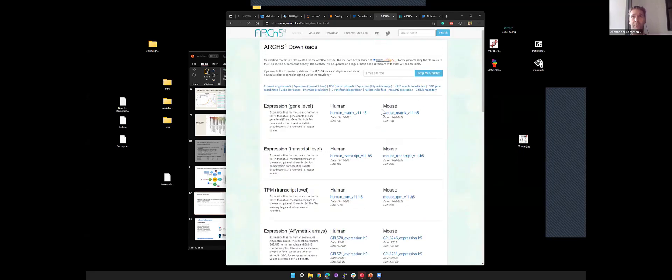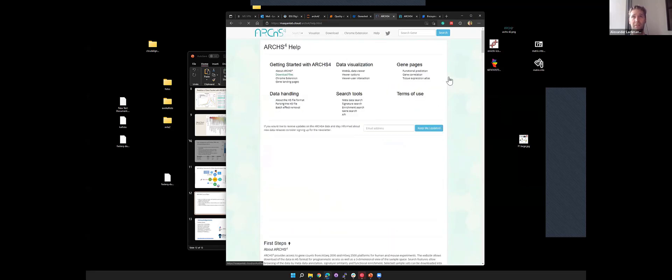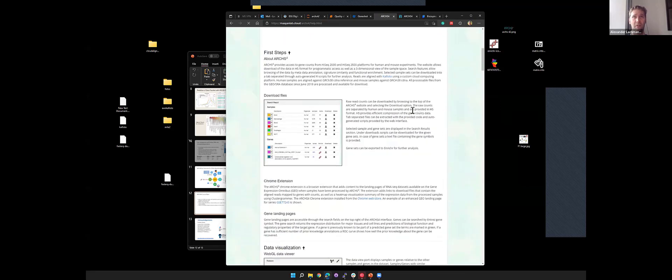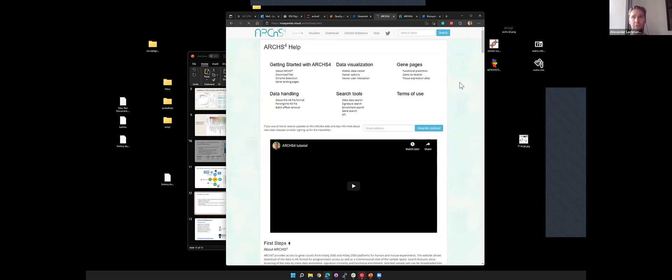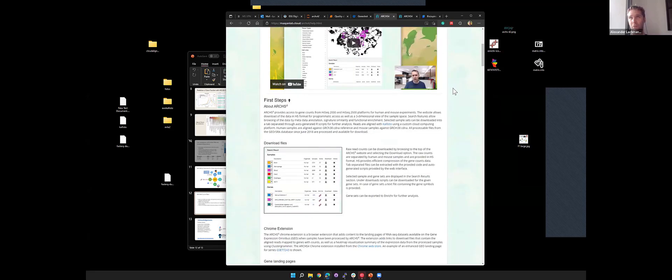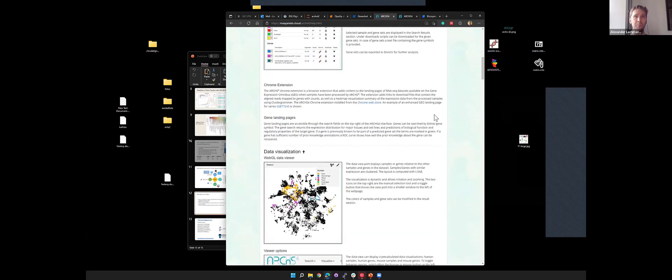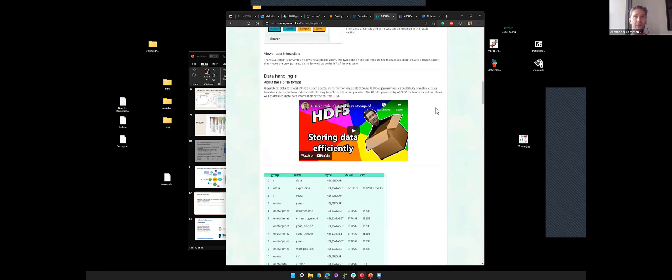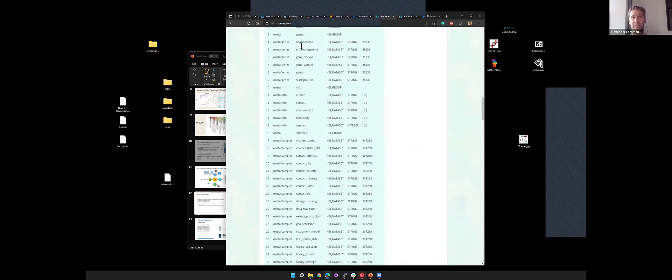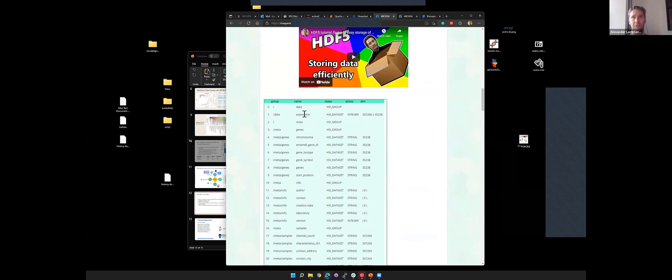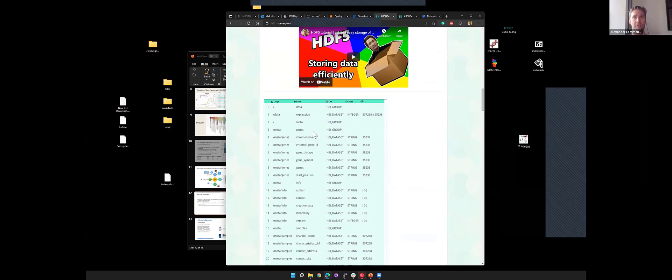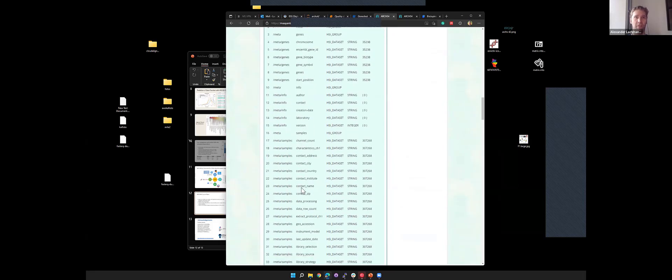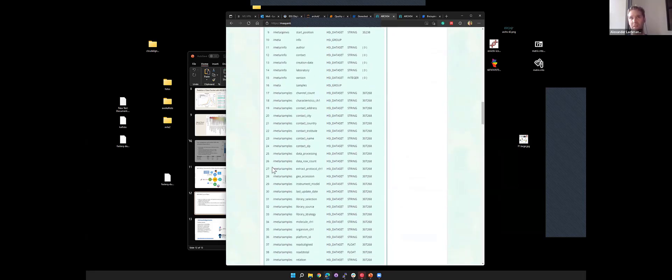We have an extensive help section. We have a YouTube video that goes through the website if you want a more in-depth introduction to it. This also shows all the metadata. This is kind of the inside of an H5 file. Looks a bit scary, but in the end this is the important field that you're interested in. This is the data expression. You can see the number of samples that we have and the number of genes. Then in the metadata you'll find all the sample information, the accession IDs, stuff like that.